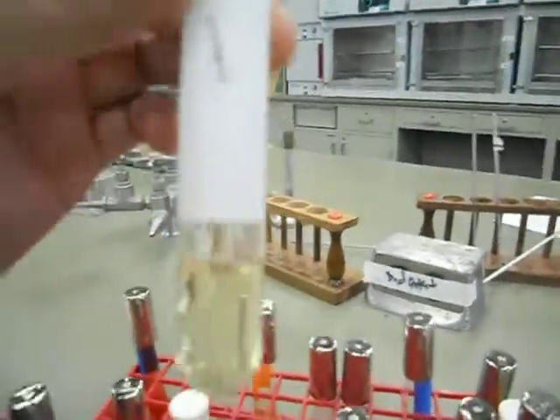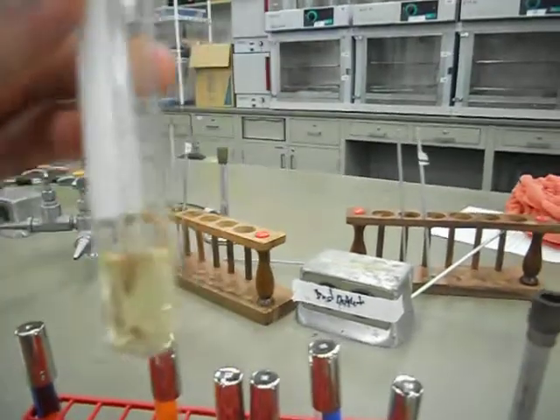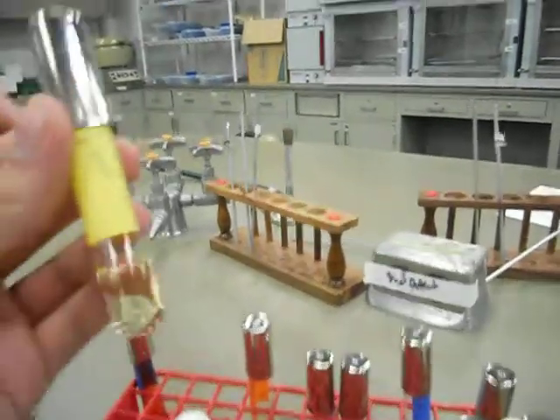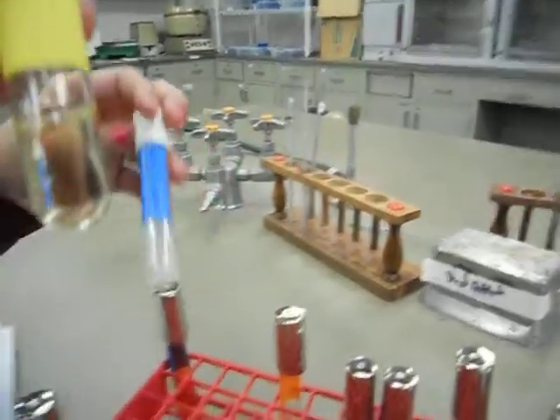What is this? Nitrate. Okay, nitrate — it looks like a nutrient broth but it has a Durum tube in it. Mstaff? What the hell is Mstaff? I don't know. This is Mstaff — it looks yellowish.